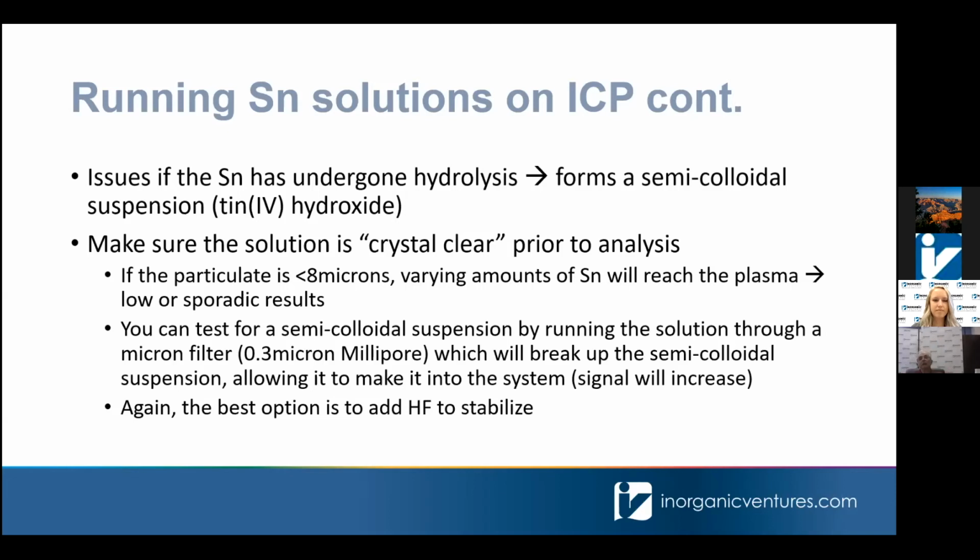Now, let's say you look at the solution and everything looks hunky-dory. We know this chemistry is dependent upon order of additions and how much is there. It gets really, really complicated when you start mixing solutions, and you have literally to the nth power possible combinations of reagents and elements. What I want to encourage you to do is always suspect, at least in the validation phase of your method, that you might have a semicolloidal suspension, because you'll look at the solution and it'll look clear.